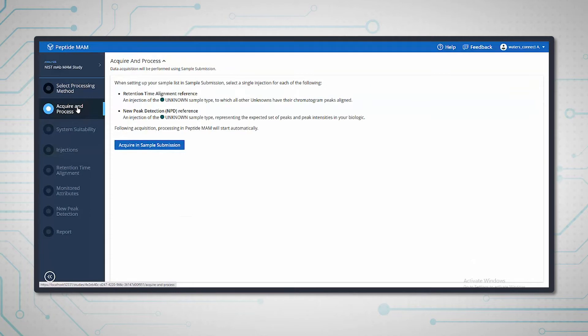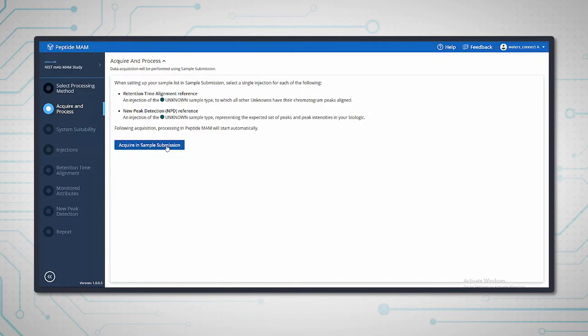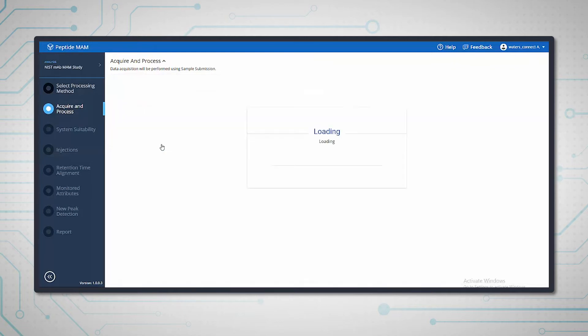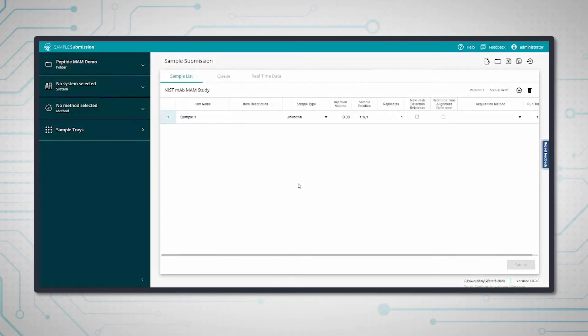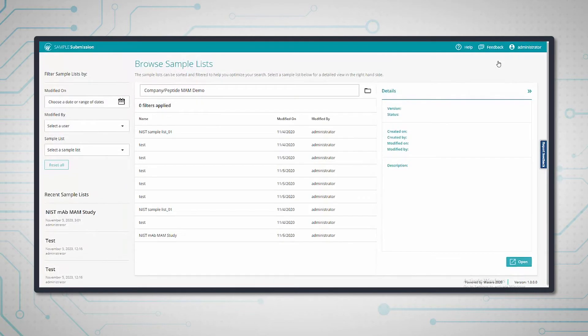In the create analysis workflow, this is where we go into the sample submission part of Waters Connect and set up the sample list to acquire from. Now we're in the sample submission app, and I'm going to open the NIST sample list that is already created.